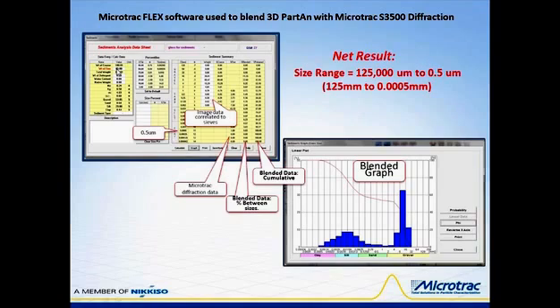Now, some of these callouts, let me define. You'll notice that the size in the first callout on the left shows a minimum size of 0.5 microns, and that's based upon the data that we obtained from Microtrac software. So we're actually talking about submicron sizes here. The image data correlated to sieves has been attained by that correlation that Terry described and I showed you in the previous slide. All that was necessary was to take that information and enter those values manually.